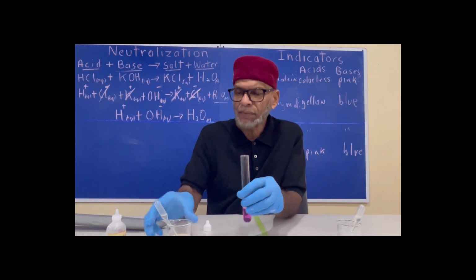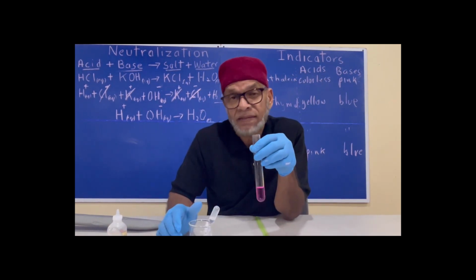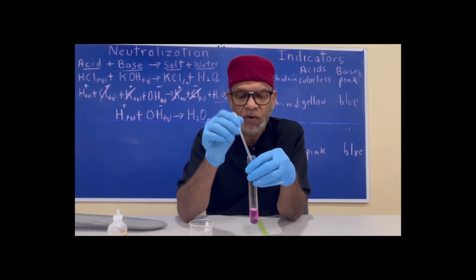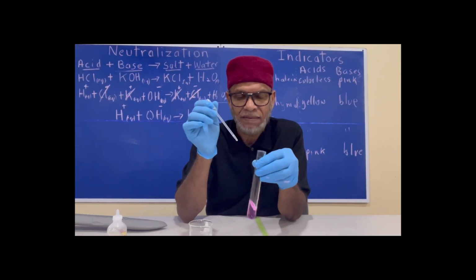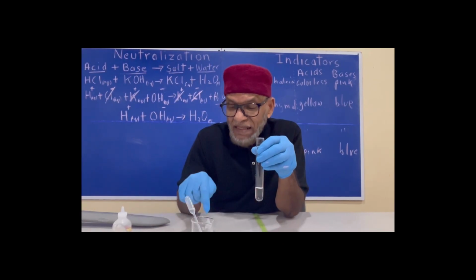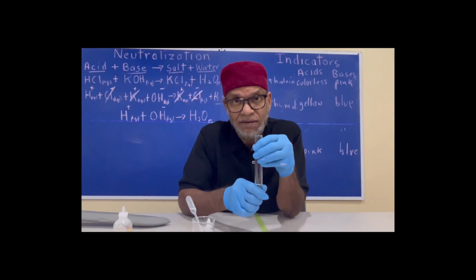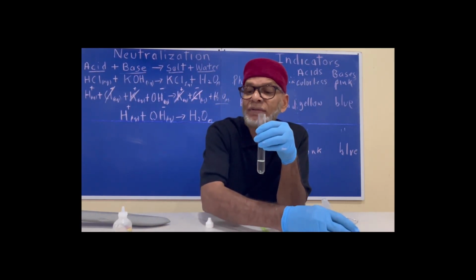What do you think will happen if we now pour a few drops of acid inside? Let's see what's happened. What do you think is going to happen? Why did that happen? Because the acid was able to neutralize the little bit of excess base there, okay? And now the acid is left in excess. And we can keep doing this all the time, right?